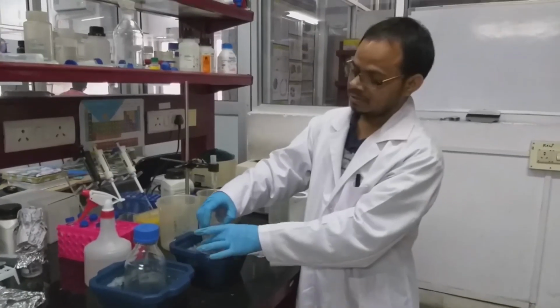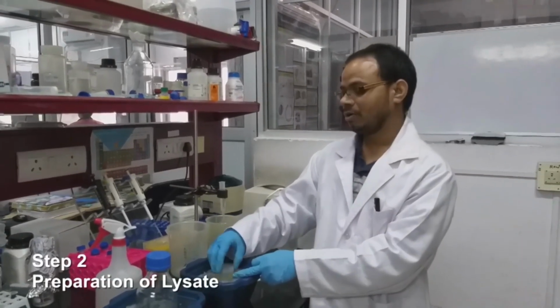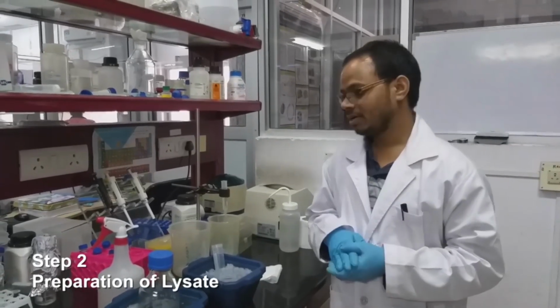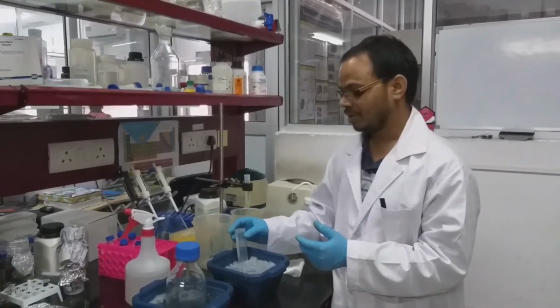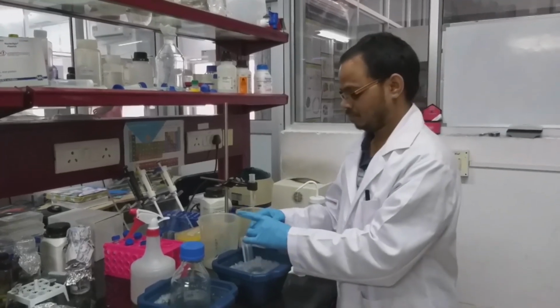We have lysed the cells using sonication. Now we have to centrifuge the lysate to get the supernatant. That supernatant we will load onto the nickel NTA column and purify the protein. So I will transfer it into a 50 ml centrifuge tube, then I will centrifuge.